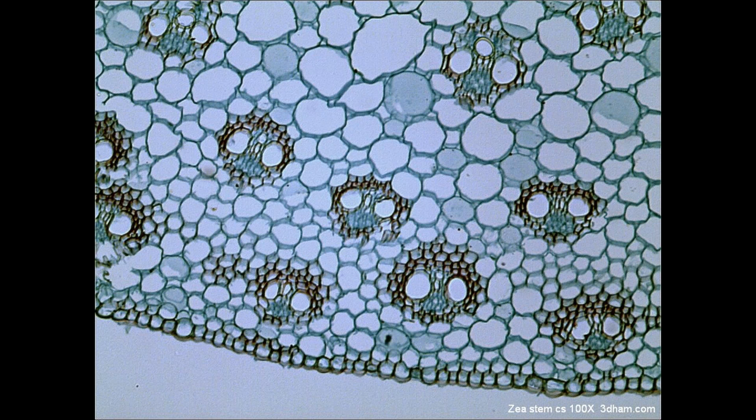Fine. And this is one specimen, how it appears in a bright field microscope. So you can see the background is bright, but the cells or the structures appear dark in color. So that's all about the normal light microscope, nothing but the bright field microscope.